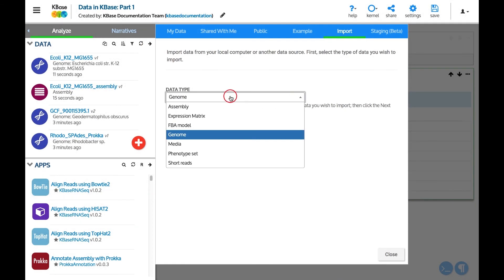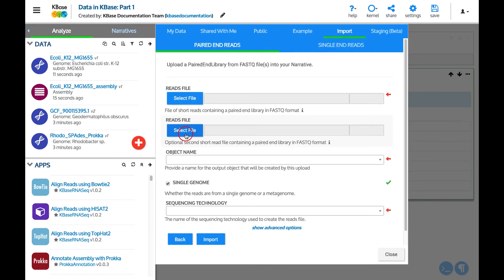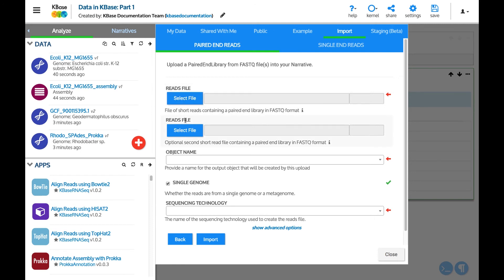Now let's upload some short reads into the narrative. Two tabs are shown at the top of the short reads importer. There is one for paired end reads and one for single end reads. For this example, we will upload paired end reads. There are two fields to select files.